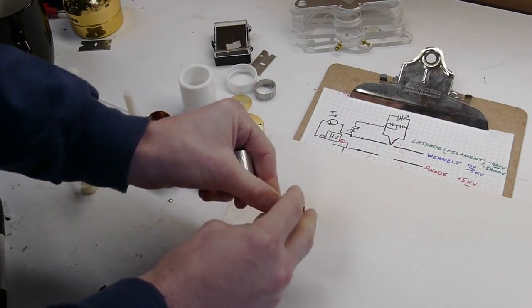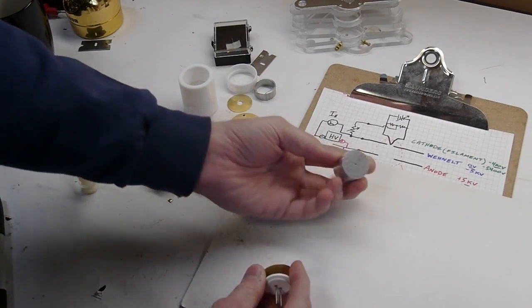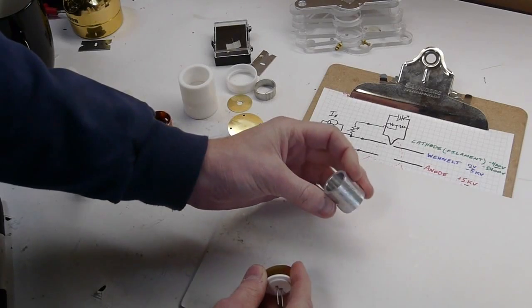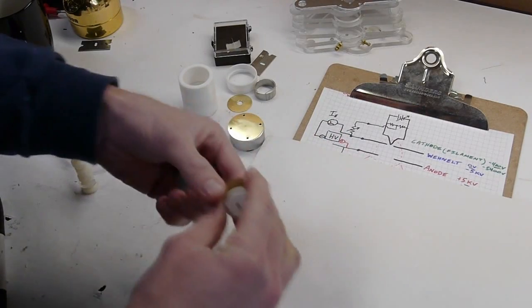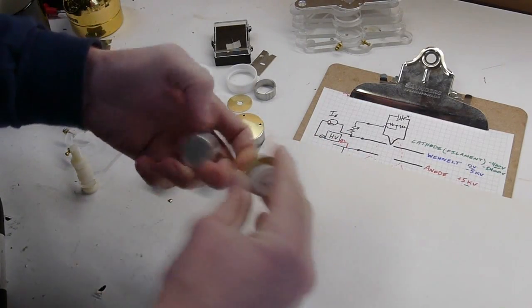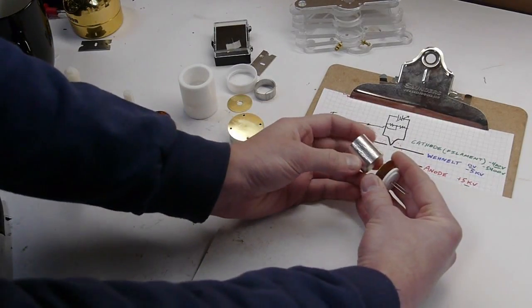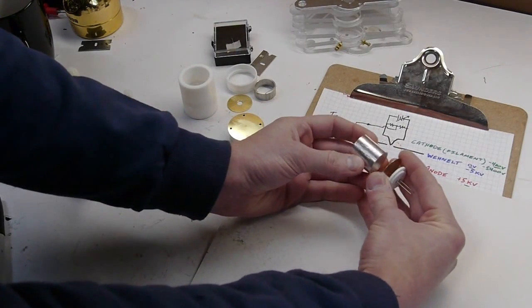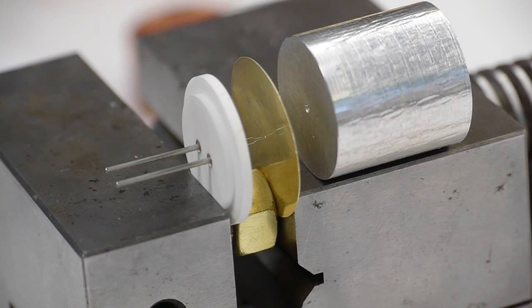And the anode itself is really just a plate with a hole too. It could be cylinder shaped like this. So in the actual electron microscope, these items are spaced out about like this. So the filament is very close to the Wenelt.